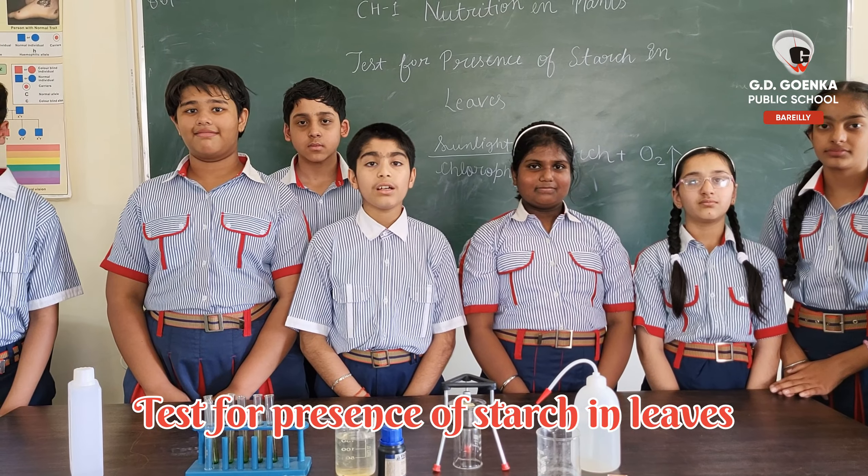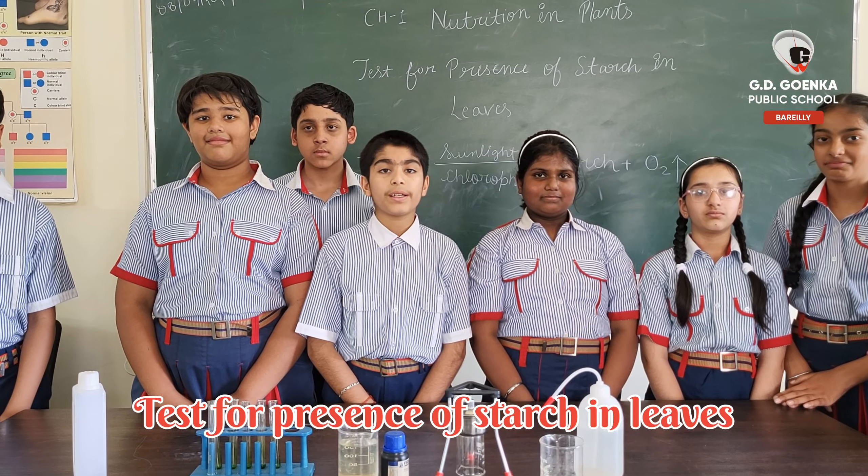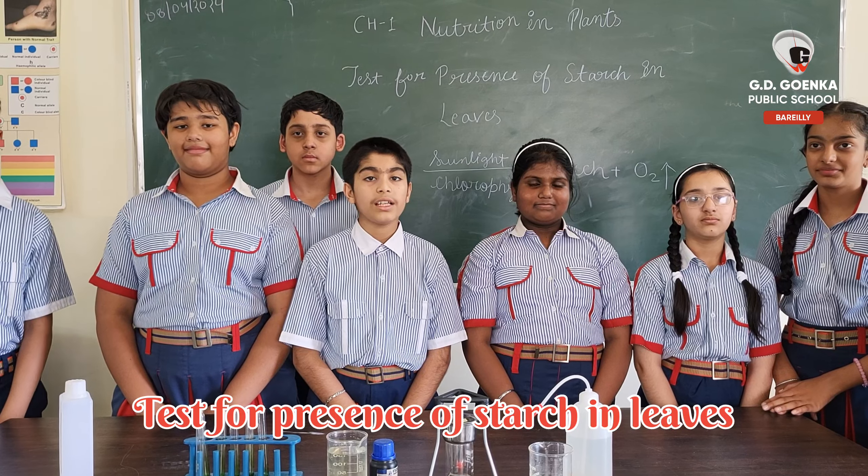Good afternoon everyone. We are here for the testing of the presence of starch in leaves.